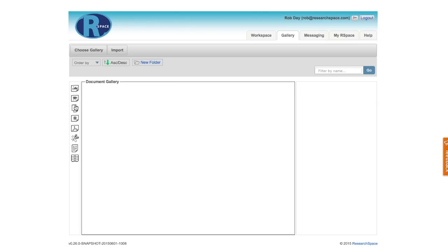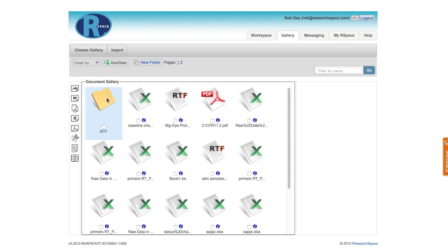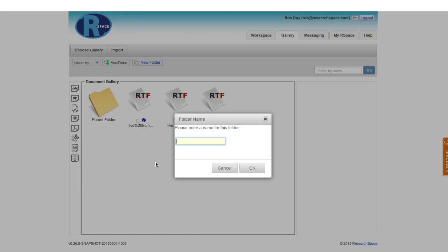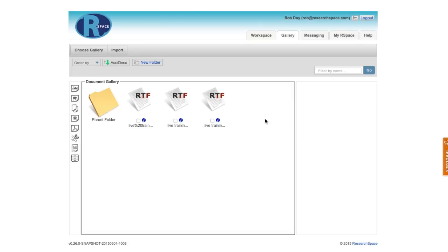You'll notice that when I do that, I can now see the new folder. And if I double click on it, I can see the three files that I just moved there. I can also choose to create subfolders within that folder, or even sub subfolders, and basically organize my files in the gallery any way I like.